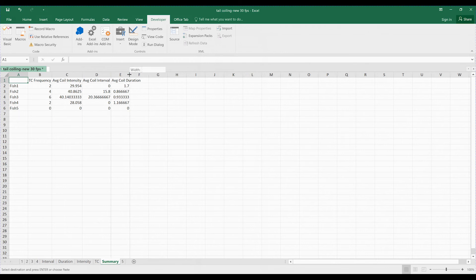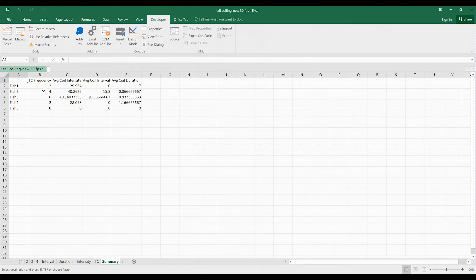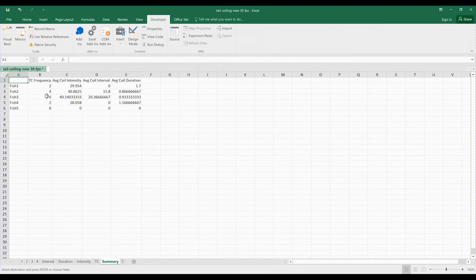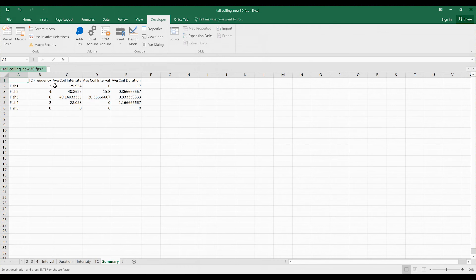In the Summary, we will have the TC frequency — how much tail coiling happened over the duration of the video. Because the video we recorded is around 30 seconds, we multiply by two because TC frequency is expressed as tail coiling per minute. So fish one has 2 tail coilings, fish two has 4, fish three has 6, fish four has 2, and fish five has none. The coiling intensity is also presented here as the average of all coiling occurrences, the same for interval and duration.